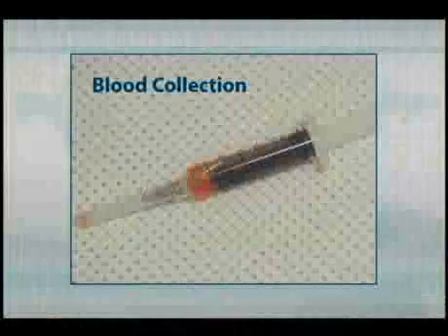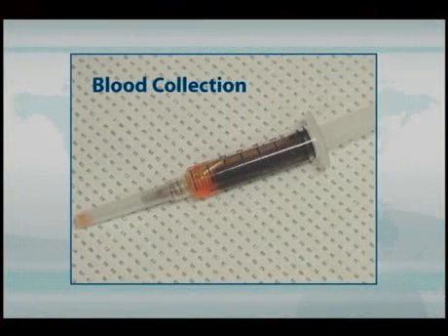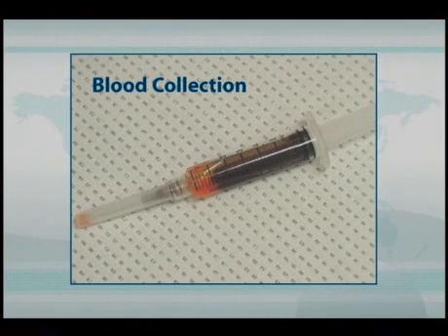Those of you who do have procedures already pretty much in hand, you probably realize that chicken blood does not particularly separate well. And so often if you collect blood, you don't often get good expression of the serum from the clot unless you have a lot of exposure of that clot to air.